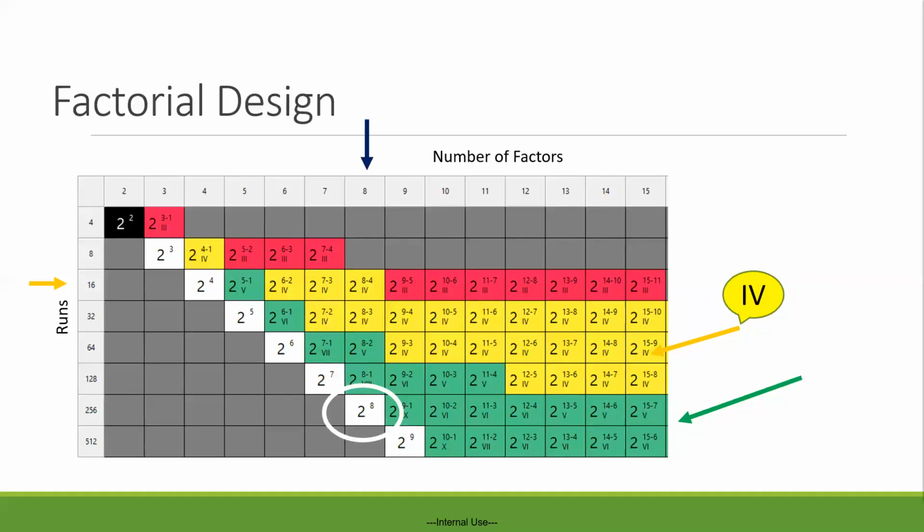The green area is not chosen because the number of runs is still plenty for the screening purpose. And we want to avoid the red area. The resolution 3 is too simple and we cannot get enough information to discuss the main effect.